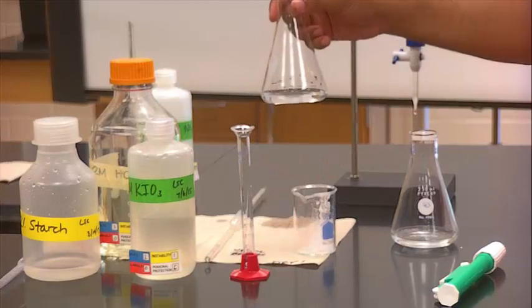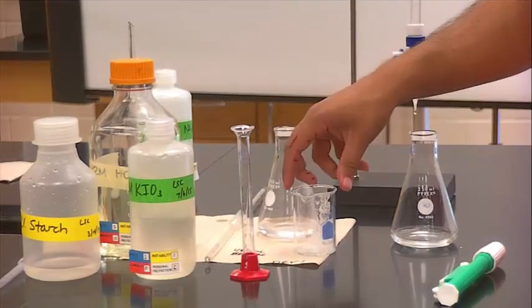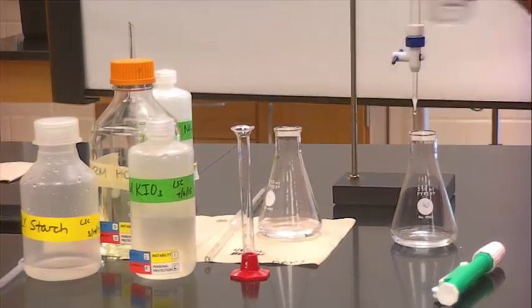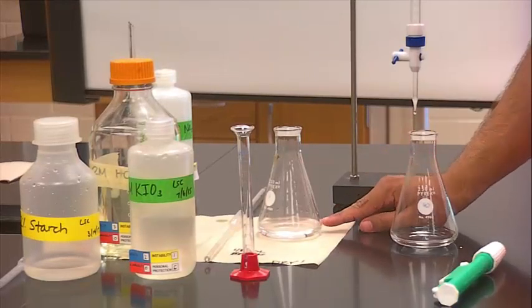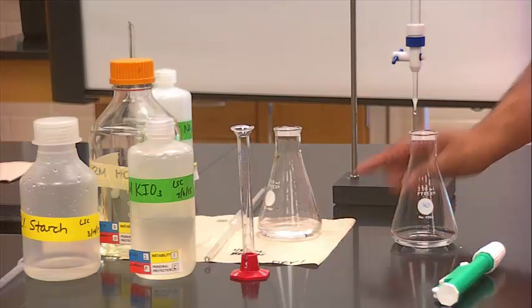Here is my filtrate containing calcium ion and iodate ions. I'm ready to perform my titration. This is the leftover precipitate. We can put that aside. We're concerned now with how much of this iodate will react with the sodium thiosulfate that's in my burette. So you can see here that I filled my burette up to the 0.00 mil mark, all the way to the top for my titration.